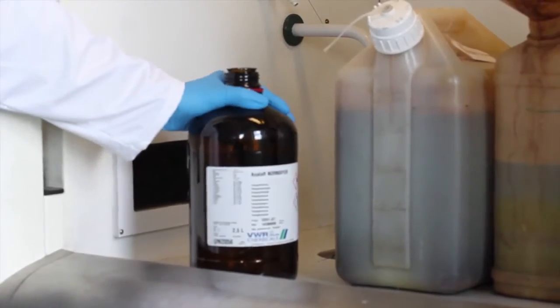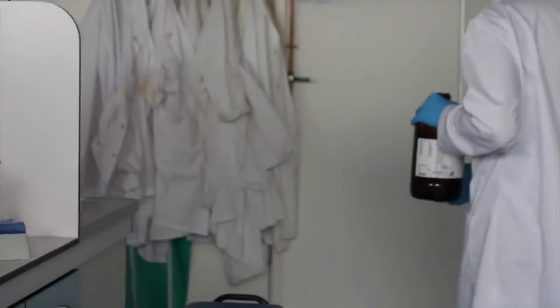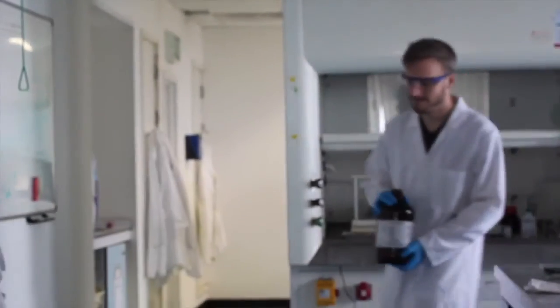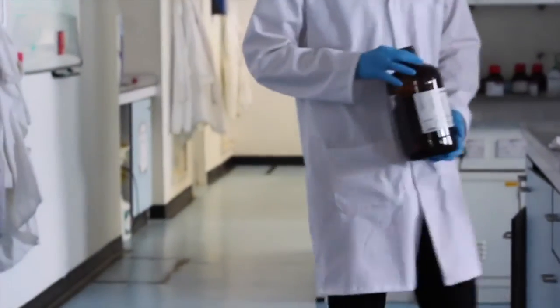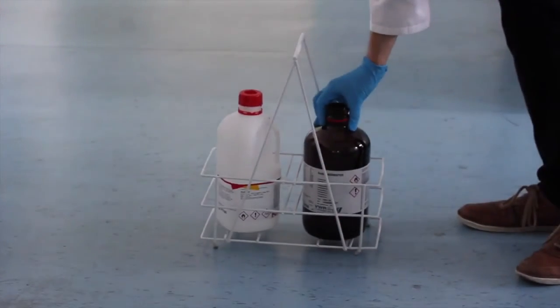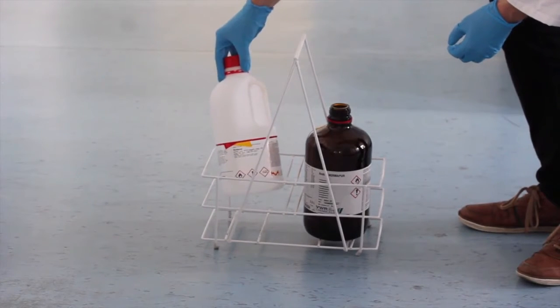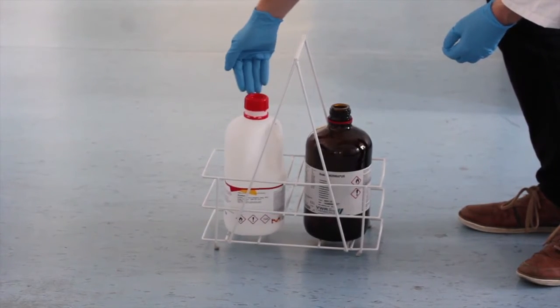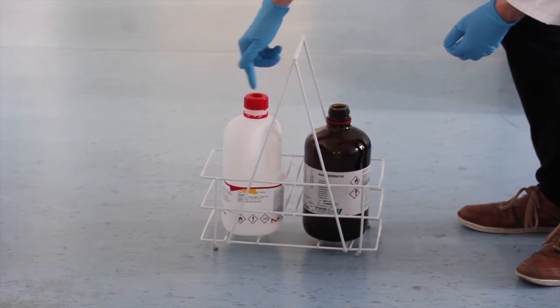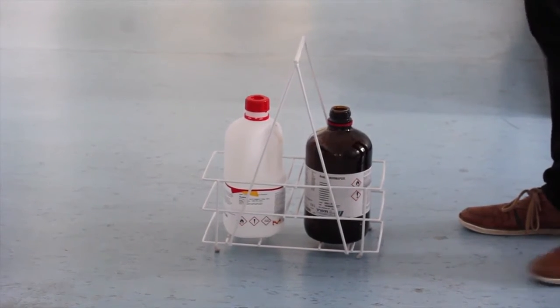Please note that we recycle 2.5 liter solvent bottles. We can either use them to replace full solvent waste containers or we can give them back to the chemical store. So, when the 2.5 liter solvent bottle is empty, please leave it under a fume hood for at least 1 hour so that the residual solvent evaporates, and then put it by the solvent bottle racks found at the central lab entrance. The 2.5 liter plastic bottles of acetone are refillable, so when empty, please keep the cap and put them by the solvent bottle racks as well.